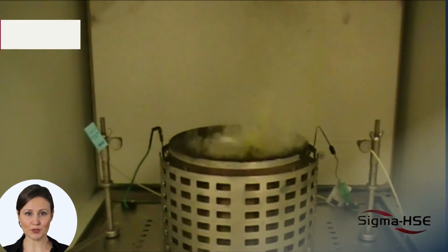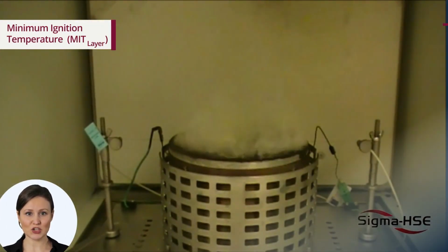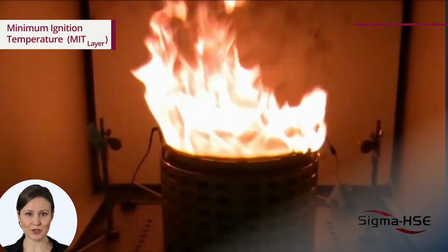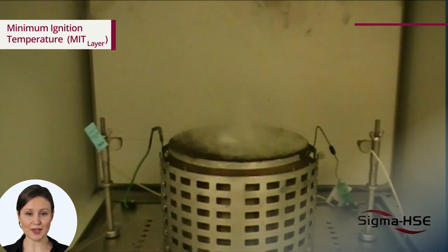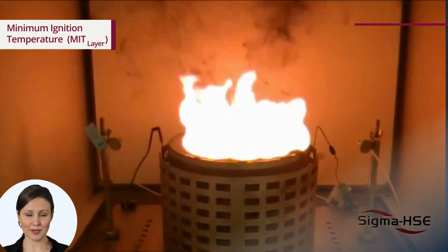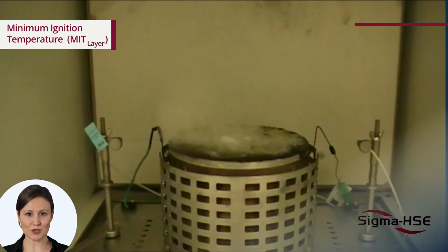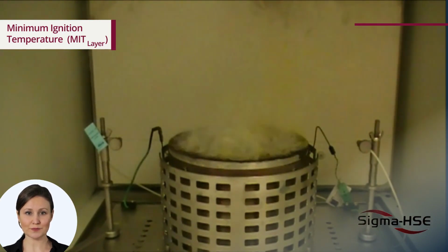Minimum ignition temperature, MIT layer. The minimum ignition temperature layer test is conducted to determine the lowest temperature at which a hot surface will ignite combustible dust or powders when settled as a dust layer. Potentially combustible dust is placed onto an isothermally heated hot plate and formed into a 12 mm layer. Once an ignition temperature is observed, the hot plate temperature is reduced and tested. This is then repeated with fresh combustible dust until the lowest ignition temperature is established.